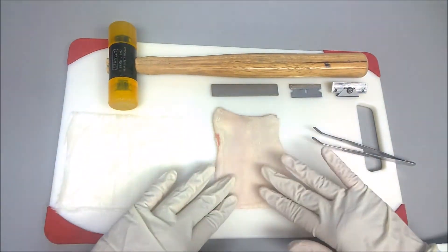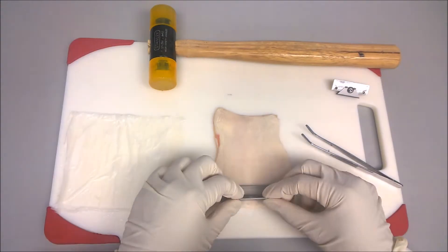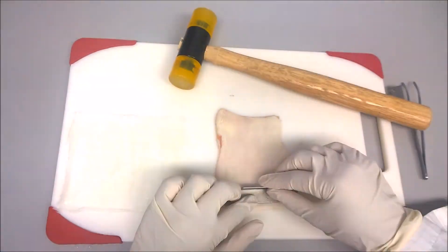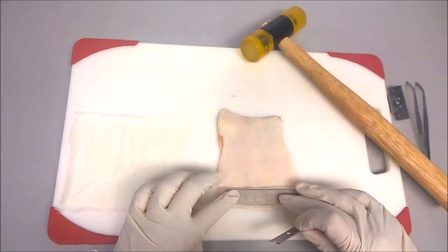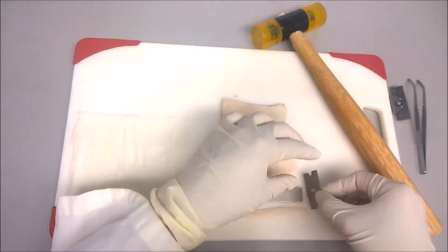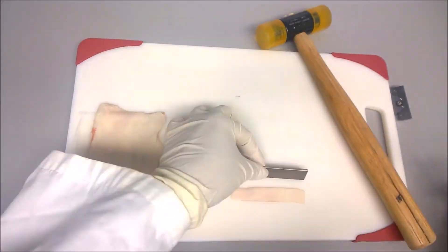Place the skin on the cutting board. Using the cutting template, cut a rectangular section of skin by firmly holding the razor blade while using the mallet.